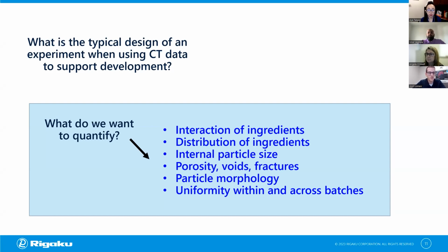So this can be something where we actually need to consider scaling our CT resolution back. So rather than scanning one tablet, we can scan 3+ tablets in one scan to assess their overall uniformity and consistency of structures that we may have observed at higher resolution.